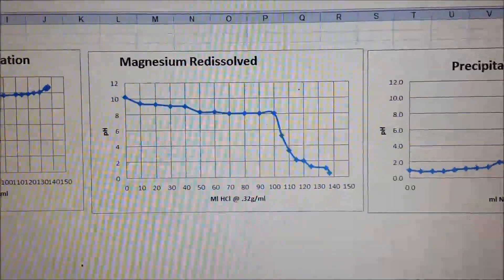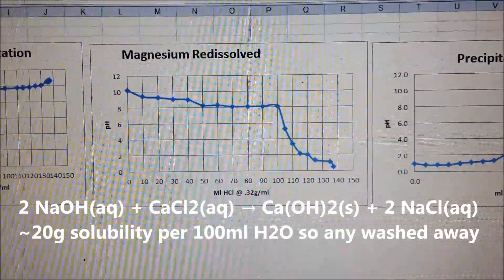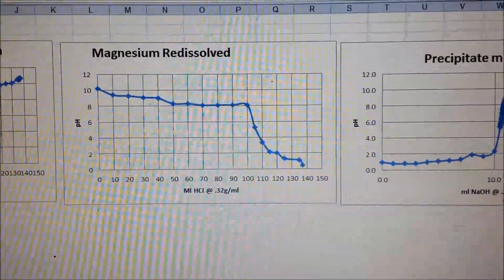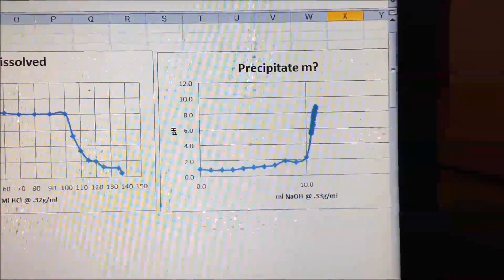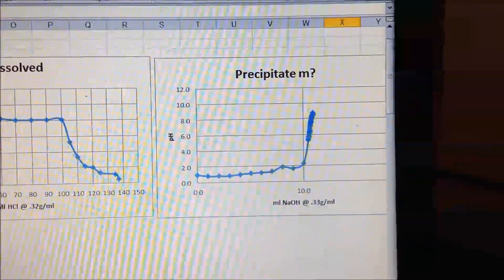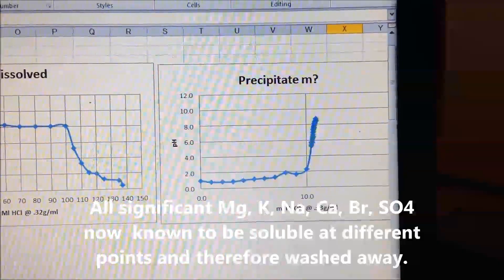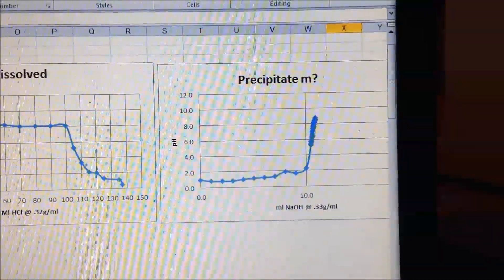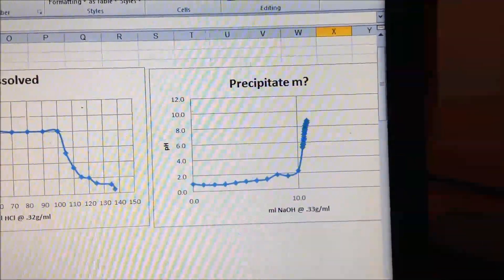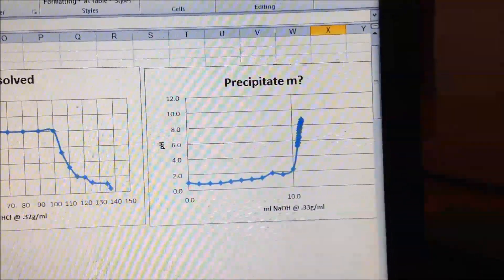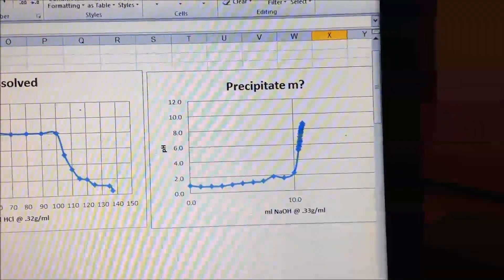So when we've redissolved the magnesium, we've got magnesium. Now the other thing I'm not totally sure on is calcium, but there is only about 0.2% calcium in Dead Sea salt, so there's a possibility of calcium still being in solution. I'm still to check that out, but that won't change my overall opinion. Next we have then re-precipitated, and you see the amount of precipitate we've got. It is possible there is some calcium in there, but it doesn't account for the full volume of it, because it was only 0.2%. So 0.3 grams is all that could account for that. So we do have something, whether it's the so-called M-state, that's something for further investigation, but we have got something that's very interesting.